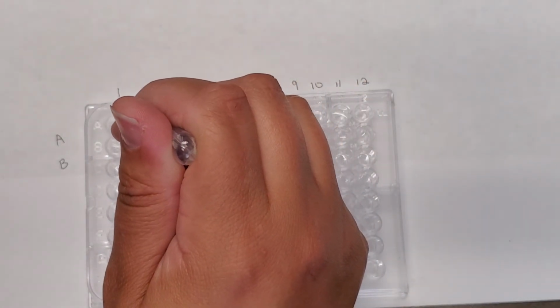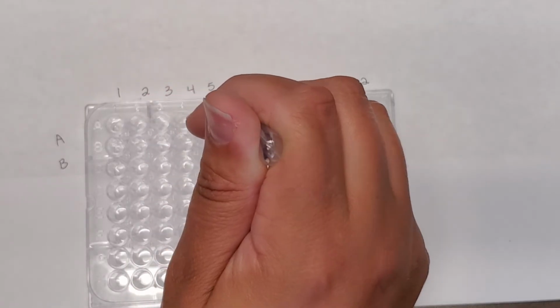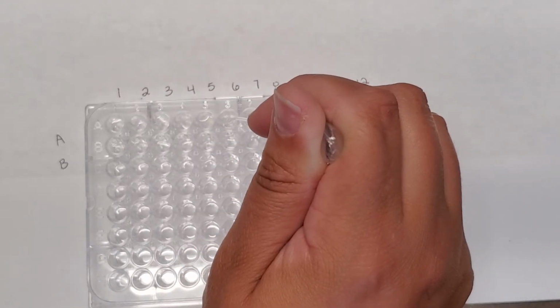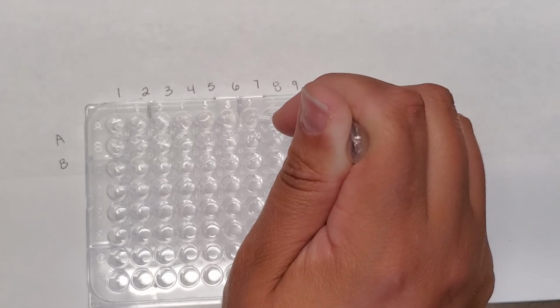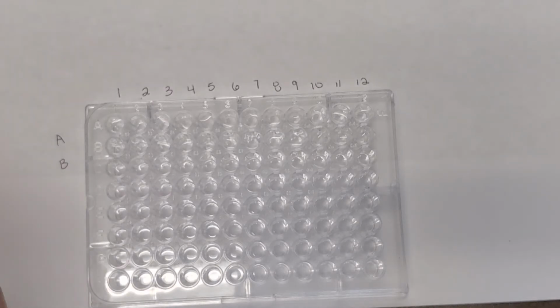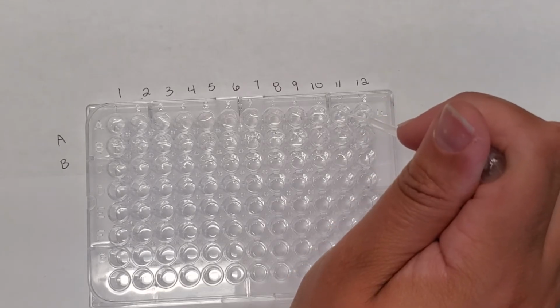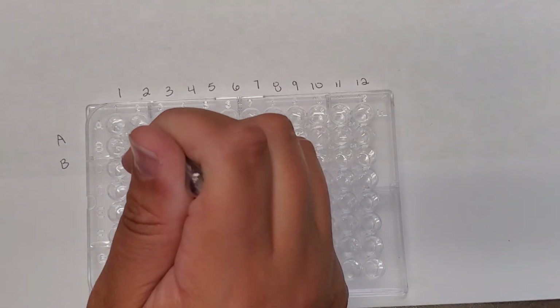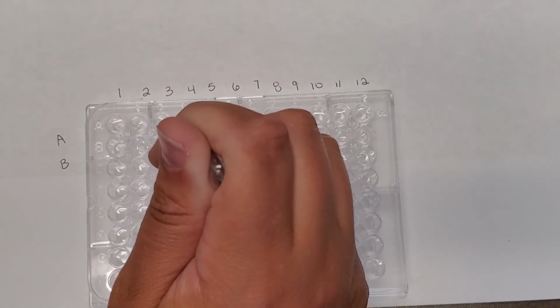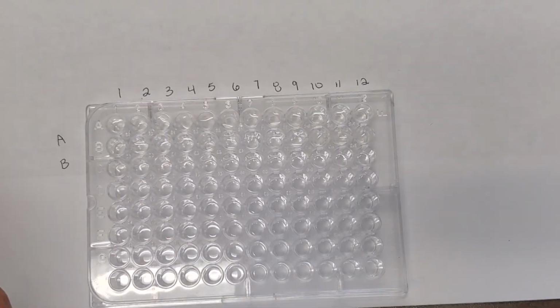And the simulated antibody, what it's doing is if the antibody is present from the patient, the secondary antibody is actually going to bind to it. So it's going to bind to that initial antibody that the patient has. If it's present, this antibody will bind to it. If the patient did not have the antibody, meaning they weren't exposed, then this has nothing to bind to and it's just going to be freely floating. This is going to be important because the next step, which is chromogen, is going to actually detect the binding of this secondary antibody that I'm adding right now to the binding of the patient's antibody if it is present.